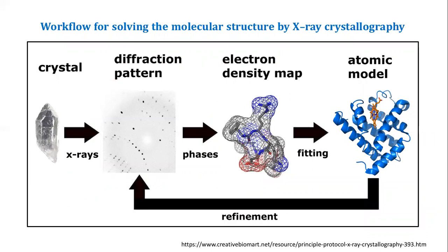X-ray crystallography. The first step is, whatever sample you are trying to study using X-ray crystallography, you need to first crystallize it. There are a number of ways of crystallizing molecules. Once you have a successful crystal, you can subject it to X-ray radiation. Once X-rays fall on it, it will diffract and produce a pattern on a photographic film. Based on the different phases, we can look at the electron density map that it is creating once the X-rays hit the crystals, and primary models can be formed.